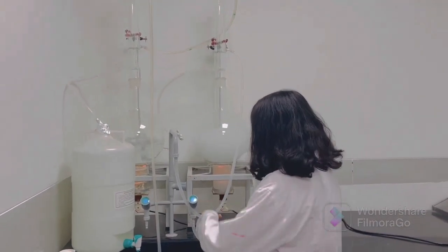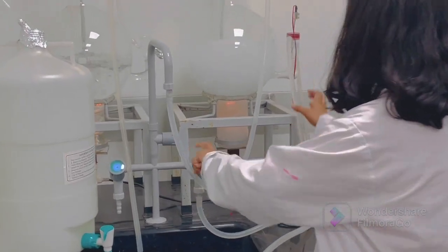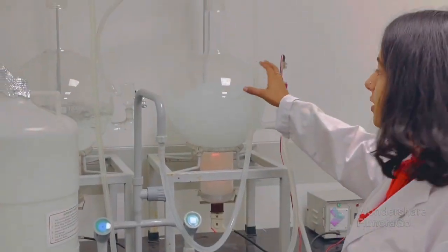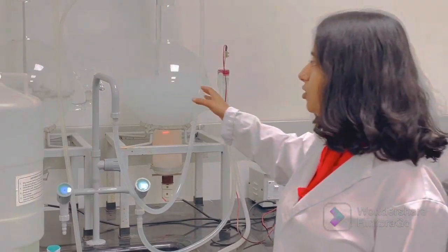Firstly, this is the tap water. This is the inlet for tap water. And in flask one, tap water contains a lot of sodium, magnesium salts, organic salts, etc.